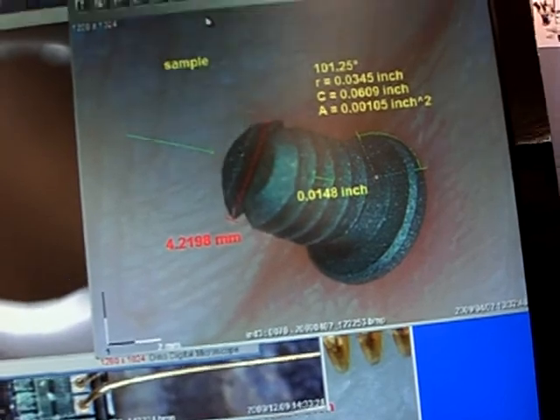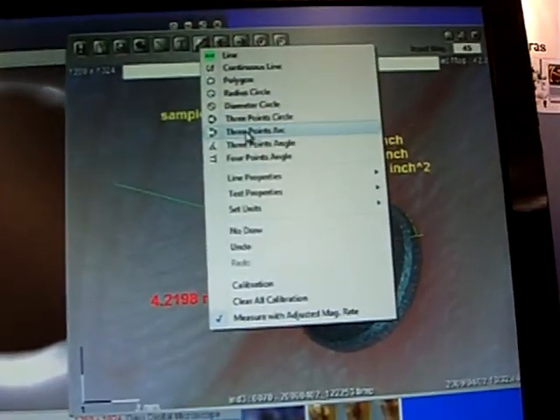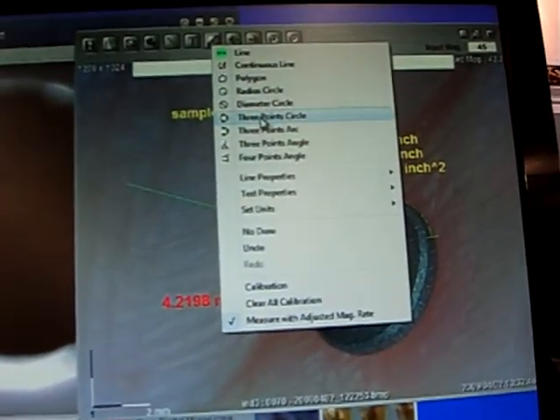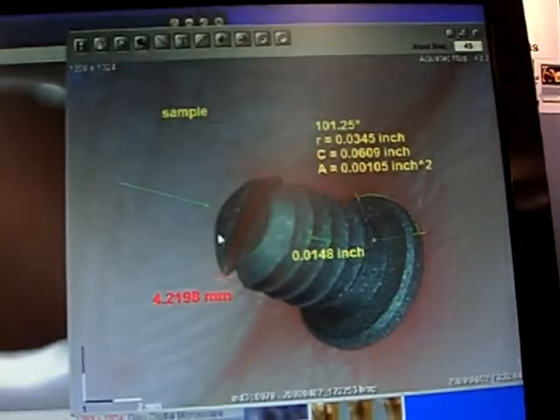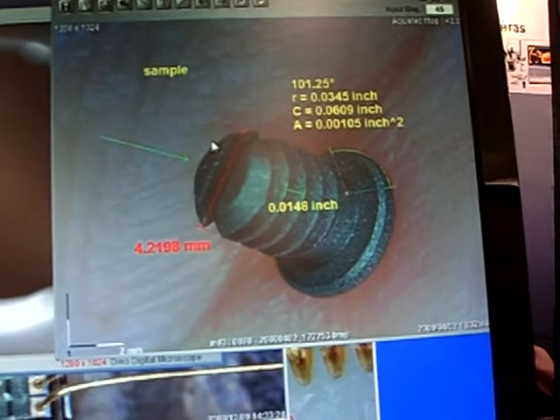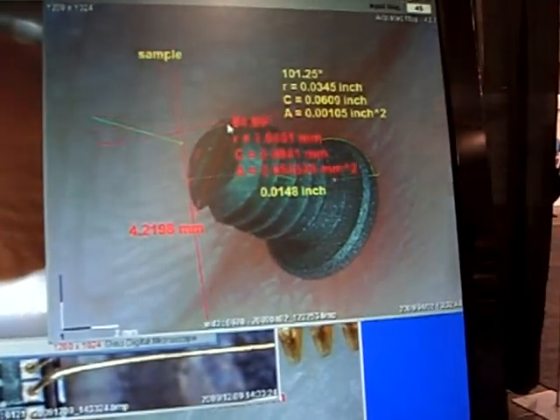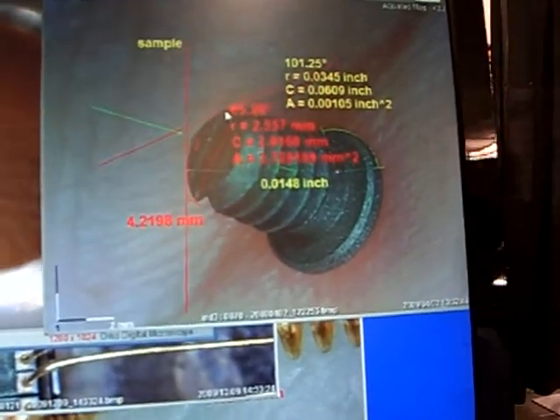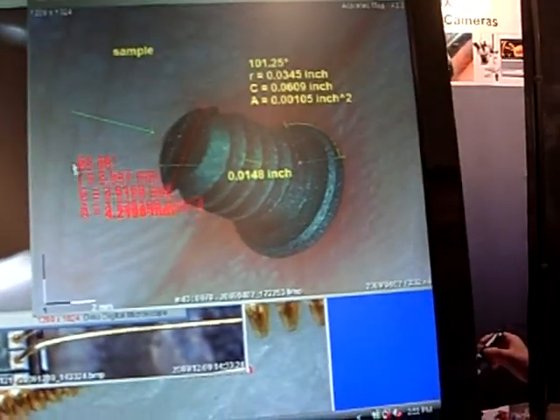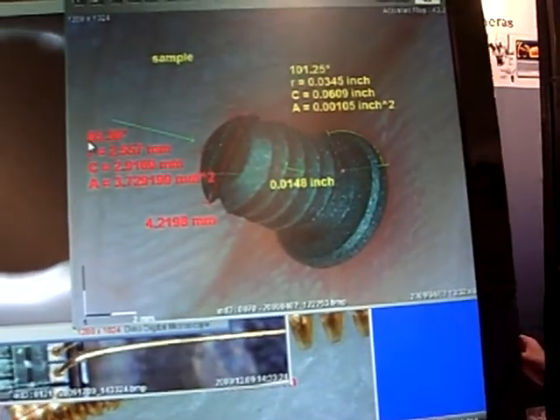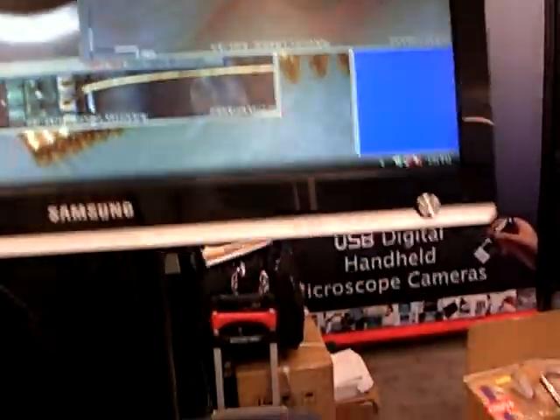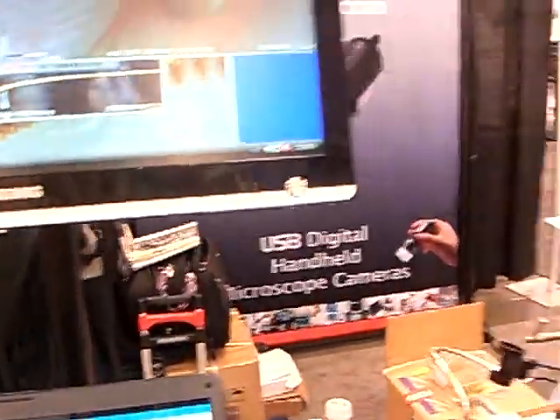You can also measure arcs. Go here to three-point arc measurement. One, two, and you can measure the arc. It's very user-friendly.